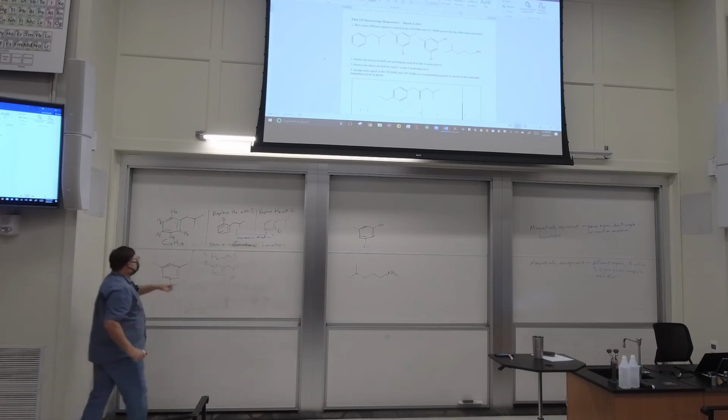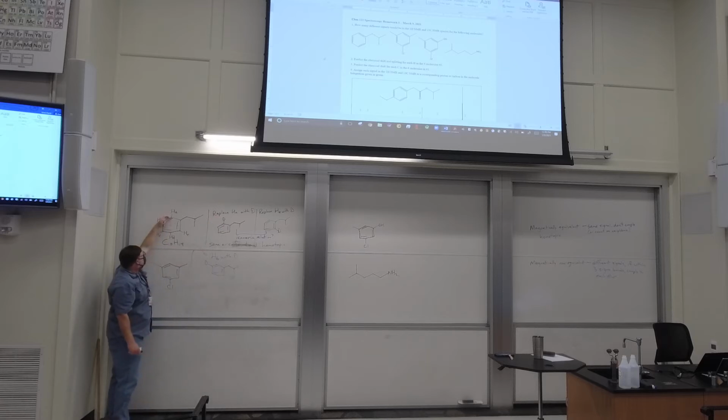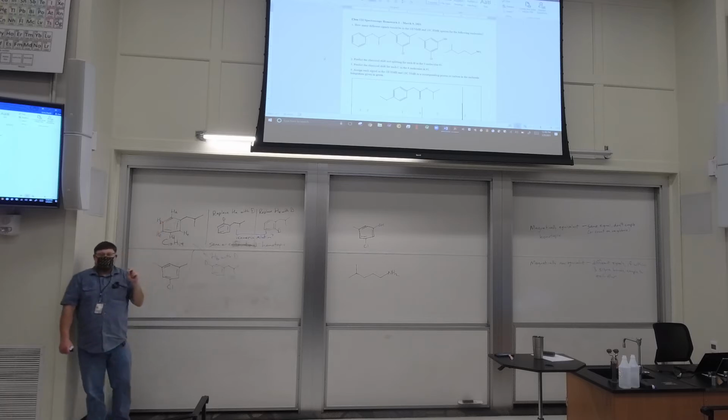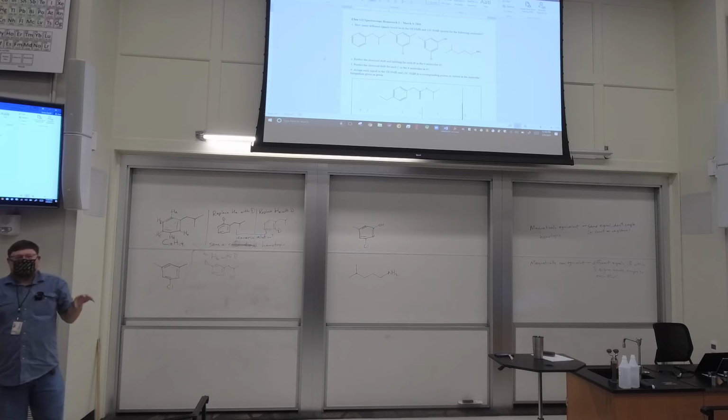HA is bonded to an sp2 aromatic carbon that's next to an aromatic carbon with an isobutyl group. HB is bonded to an aromatic carbon that's bonded to two aromatic carbons with H. HB is not the same as HA.